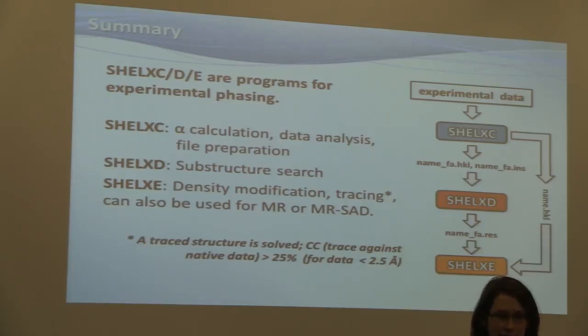And then you have to have an educated guess at how many disulfide bridges may form, or you look at homologous structures. But if you are not sure, you need to try different numbers. So this is a complete guess? No, because very often you know from the structures that are similar, and from the reductive oxidative state, and from the sequence, how many disulfide bridges to expect.